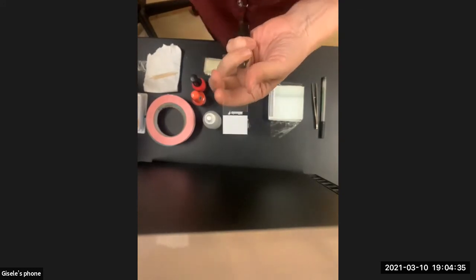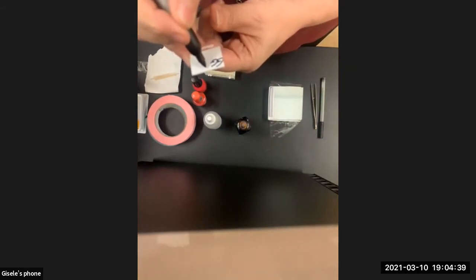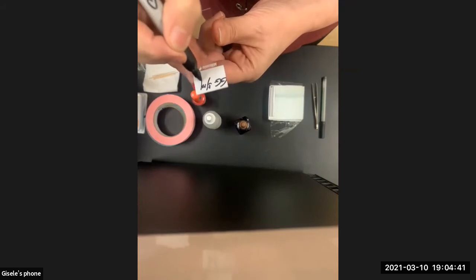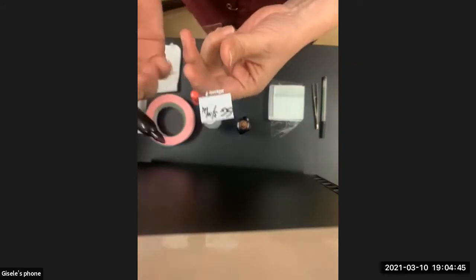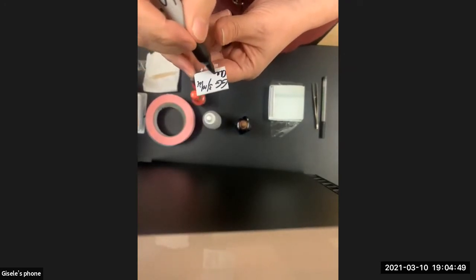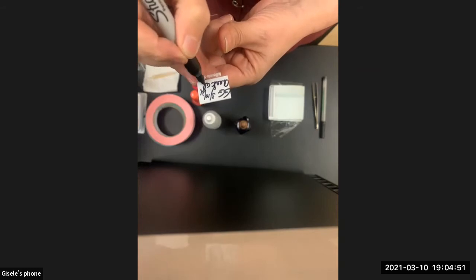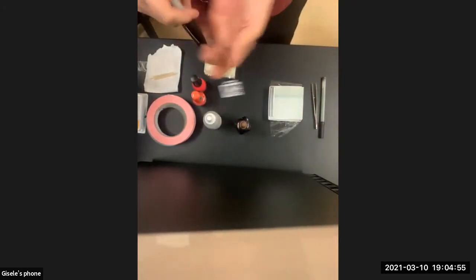Okay, good. So I will write my initials, I will write the date. In a lab, we use Sharpies always for everything. They're wonderful. And then I will write what the specimen is, cheek cells. And then I will go to my lab notebook. Actually, let me get it.